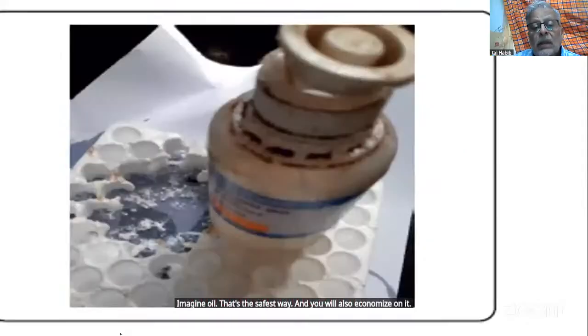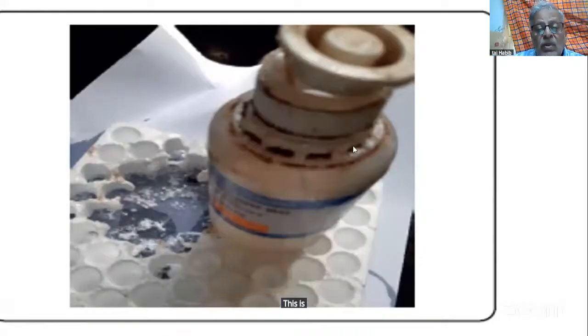Okay. Now, this is the experiment we did. This is the oil in most laboratories. It is the cheapest oil in the market. It comes in a white container, and then when it drops onto styrofoam, within a couple of hours, it eats it because it has a solvent in it. Although on it, it's written that it is xylene-free.